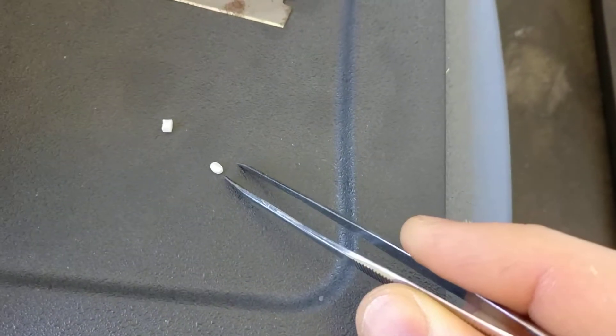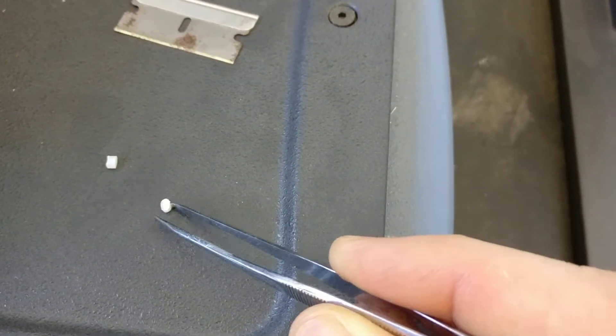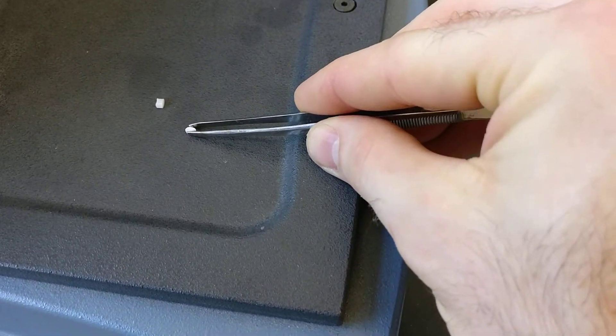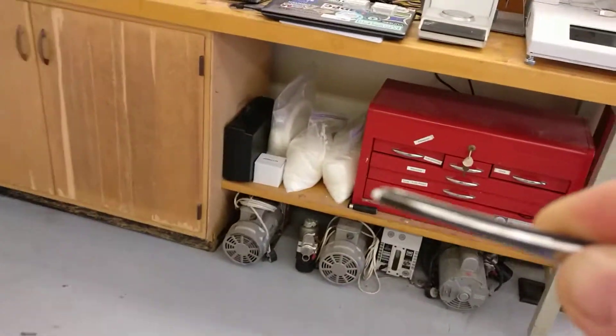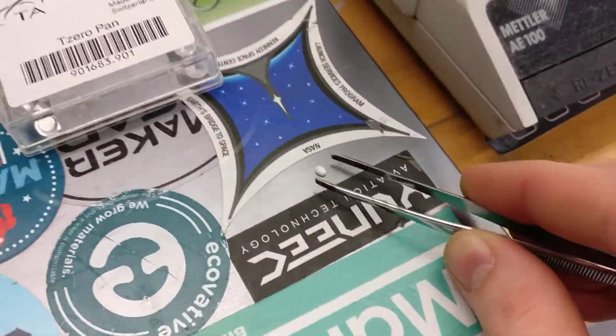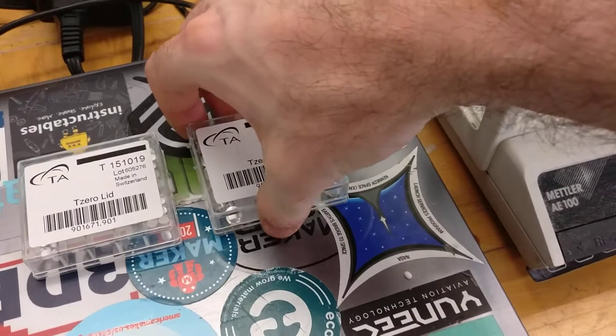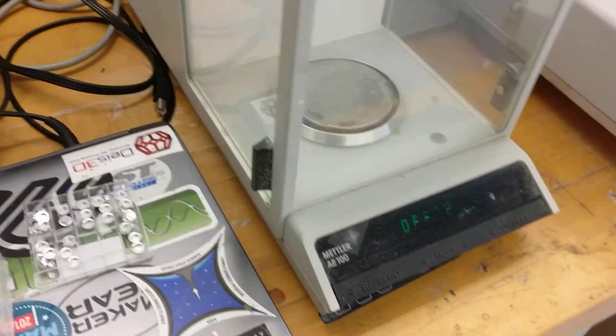That's the kind of sample size you want for the DSC — something that's pretty thin so the pan lid can sit flat. We're going to take all of these things over to the balance. Normally you wouldn't carry this across the room; you'd just cut it by the scale. The next thing we're going to do is take the pan and lid and tare them on this balance — it's a very precise balance.